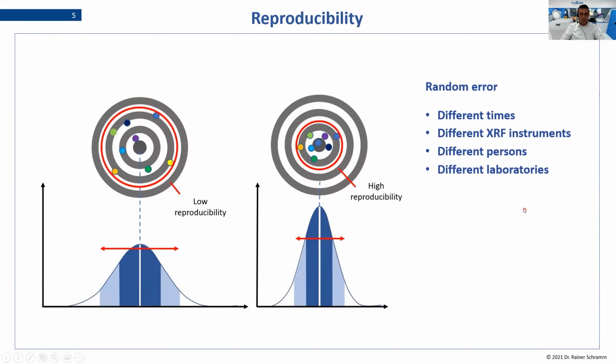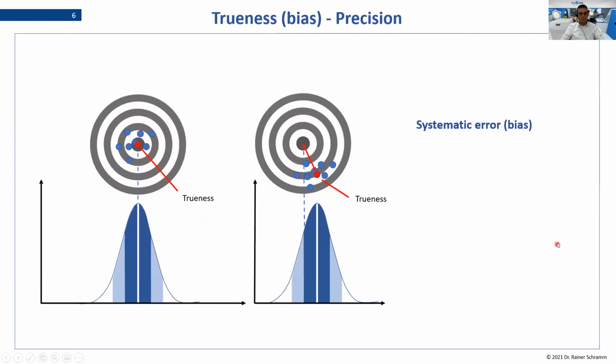There's a special case, and this is important for our quality control. If you keep the first three points, but you measure them in your own laboratory, then it is the in-laboratory reproducibility. This is a very important determination of the random error of your lab for an element, for an application. And we need this to find out if a method is under control or not.